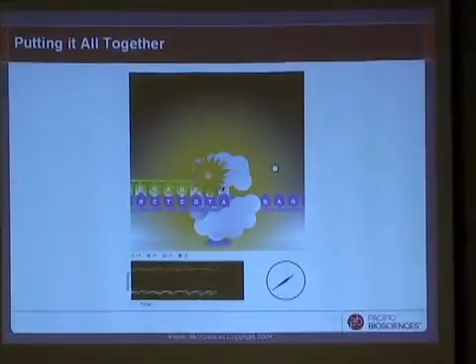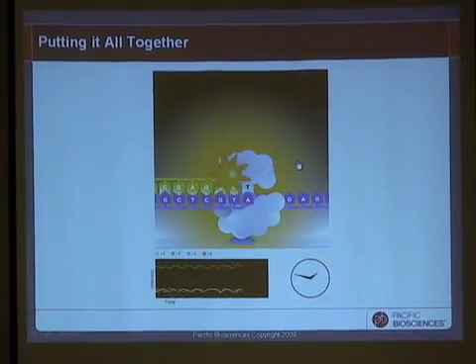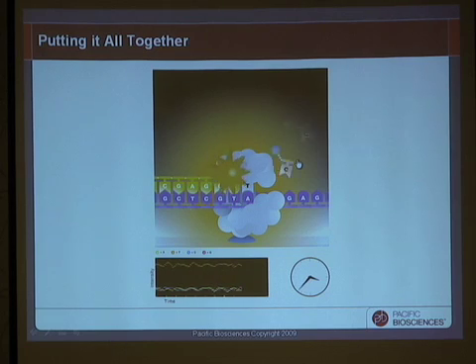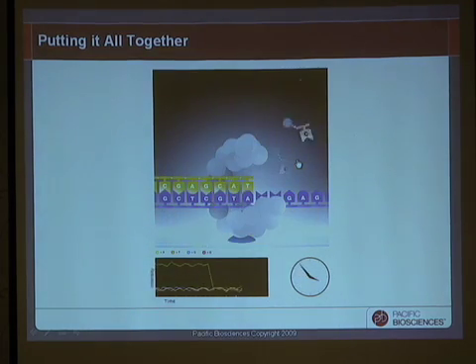And that leads to this very low and constant fluorescent background signal when there's not a catalysis event underway. When there is a cognate binding event, so that there's a correctly matched nucleotide, the fluorophore and the nucleotide are trapped for a comparatively much longer period of time, tens to hundreds of milliseconds, about 4 orders of magnitude longer. So long that if I kept on at this scale, we'd be here all afternoon, so I need to fast forward to the end when that catalysis takes place. The enzyme breaks that bond, the fluorophore is flipped away, and it diffuses. Fluorescence returns back down to baseline.